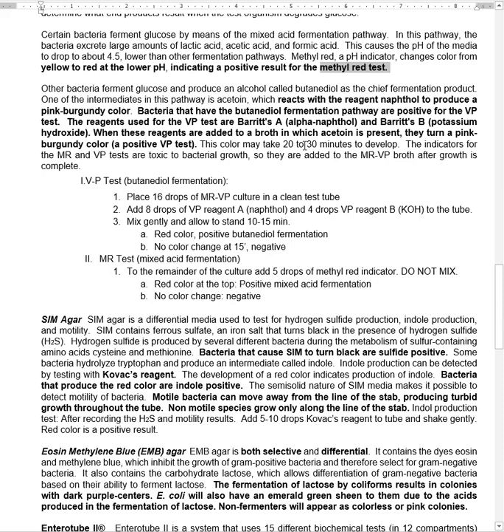This is a long test. In the lab, I tell everybody to do this one first if that's one of the tests you need to do, because it's possibly going to take 30 minutes to get a reading. And of course, the reason we don't put these in ahead of time while they're growing is because they're toxic.